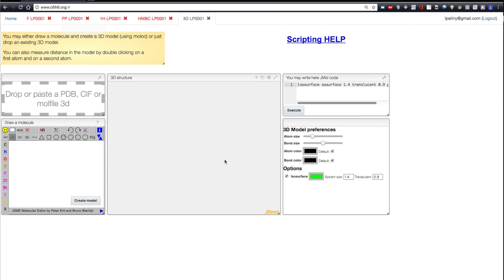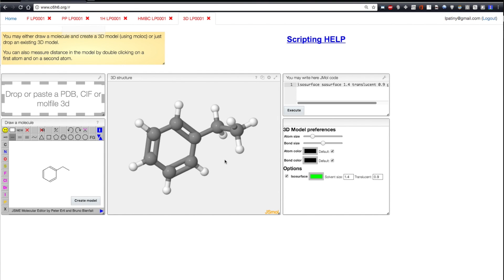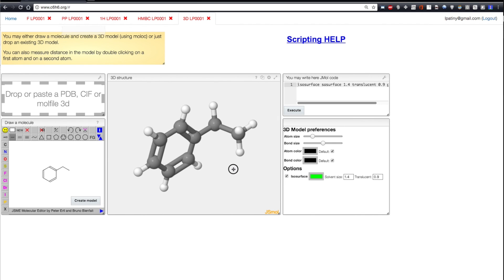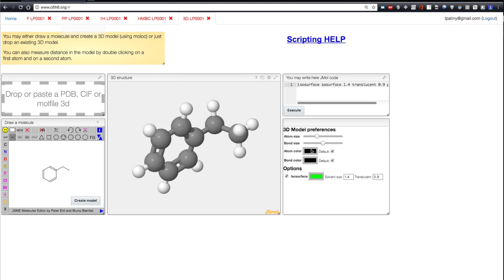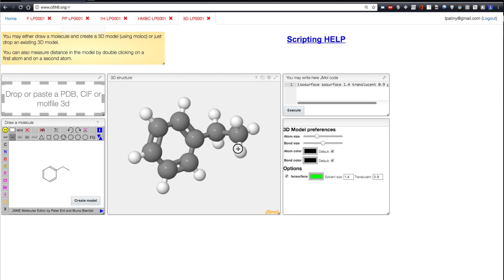The 3D model is just one click away. You just select the molecule and you get a 3D model. You can tune it, change the shape of the atoms, but you can also measure distances with just two clicks.